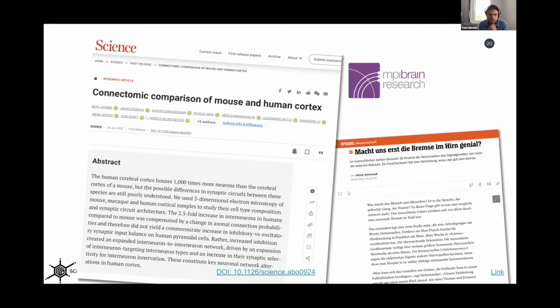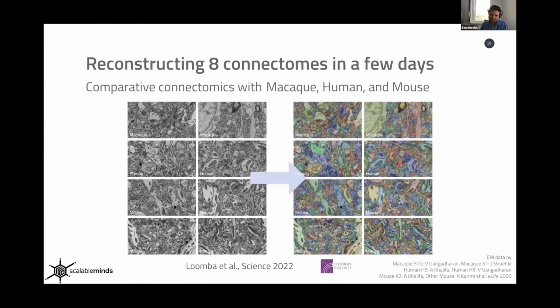At the end of the day, it brings a lot of interesting challenges on data handling and reconstruction, and I want to walk you a little bit through how our software tools help with that. Interestingly enough, this morning I realized that even Spiegel, one of the larger German news journals, picked up on this, so good timing.